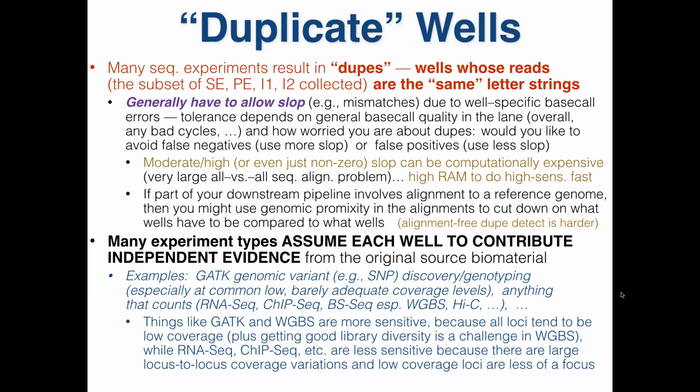So yeah, this is kind of the start of the messiness of trying to deal with dupes. The reason why they're a concern is that, well, if they come from the biology, okay, in that case we want to keep them, because any distortion of that would be distorting the actual data.